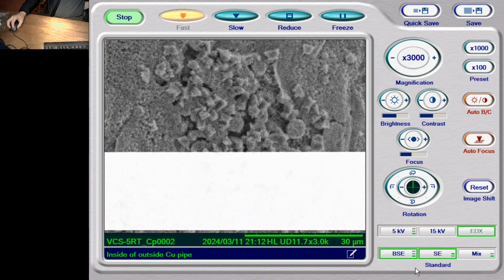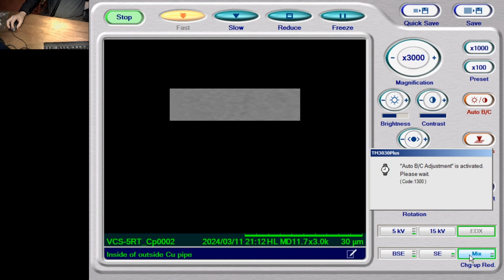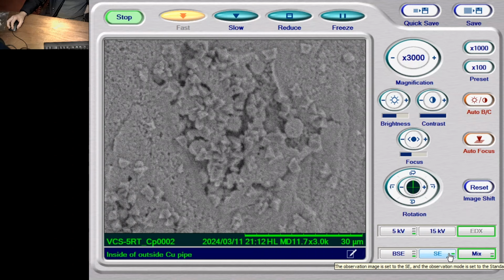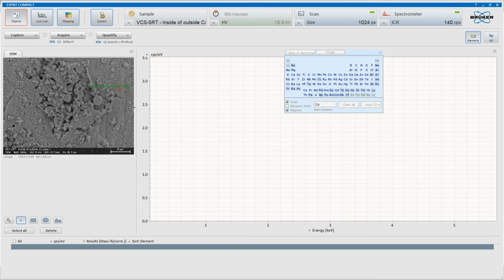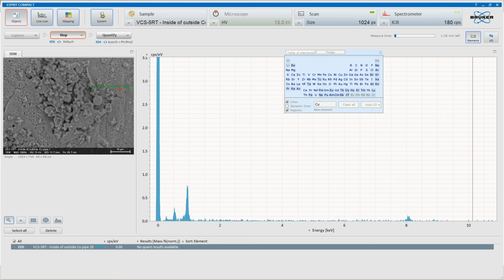Very consistent elements. So this may just be copper oxide that we're looking at here. Let's dump that across and see what we see. Let's take a particular spot, this one fairly regular here, and see what we have. Not a large amount of counts per second, but definitely got copper there. Don't think there's rhodium there. Don't think there's tantalum. It would appear to be copper oxide, Cu2O.